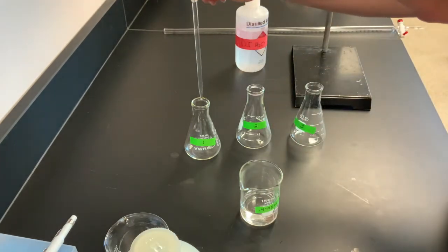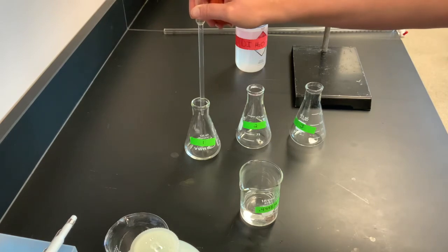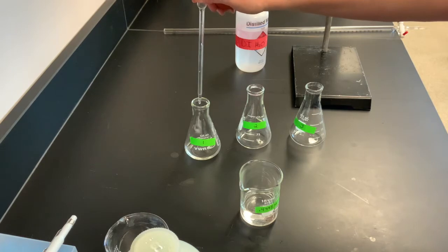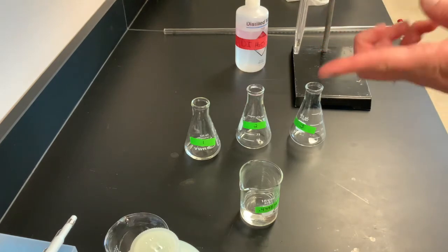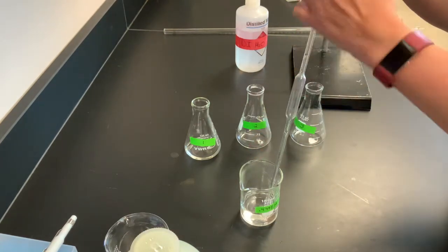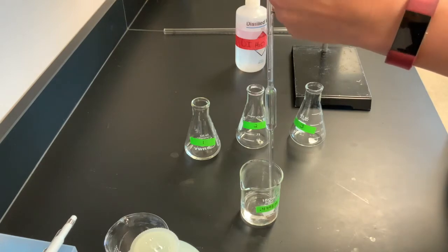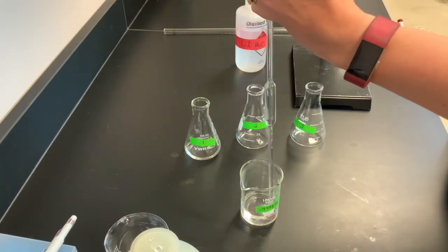We're going to then come to flask one and release the 10 milliliters. Remember, with our volumetric pipettes, we do not want to push the liquid out. This particular one is calibrated so that it is 10 milliliters from the fill line to this last part. So the fact that there's still liquid in here, that's okay. So it's calibrated to be from here to that fill line is exactly 10 milliliters. So we're going to repeat so that we can get 10 milliliters in our other 2 flasks. A little bit more in there.